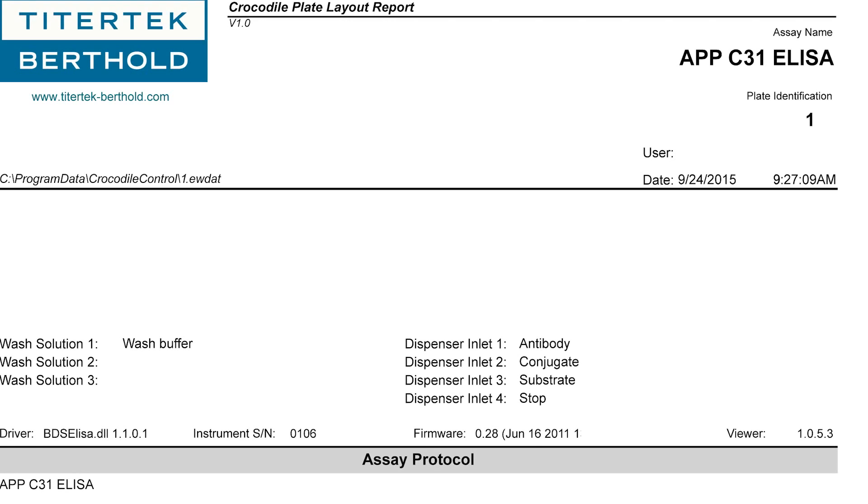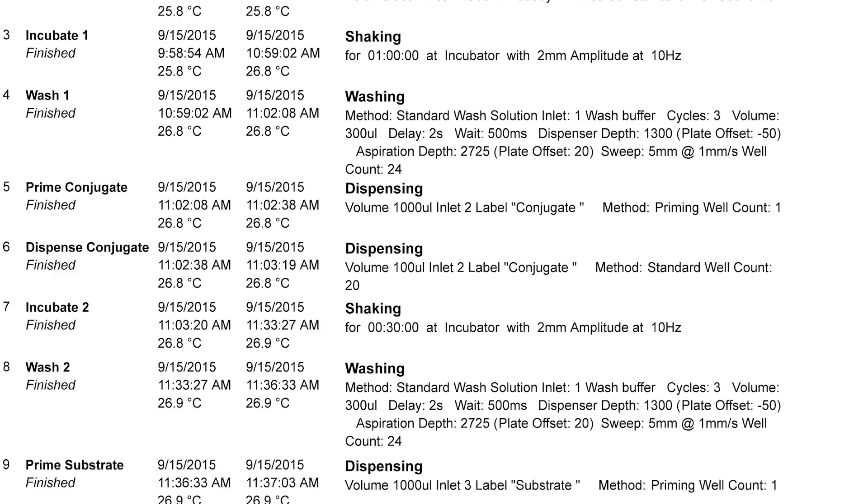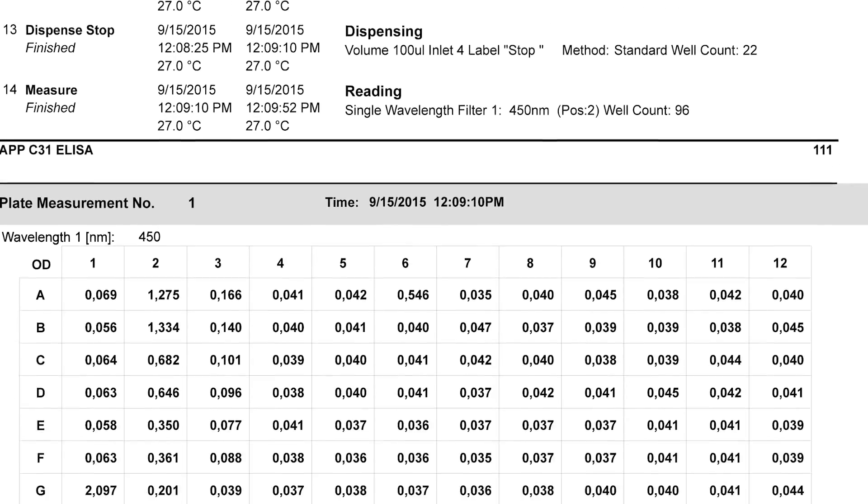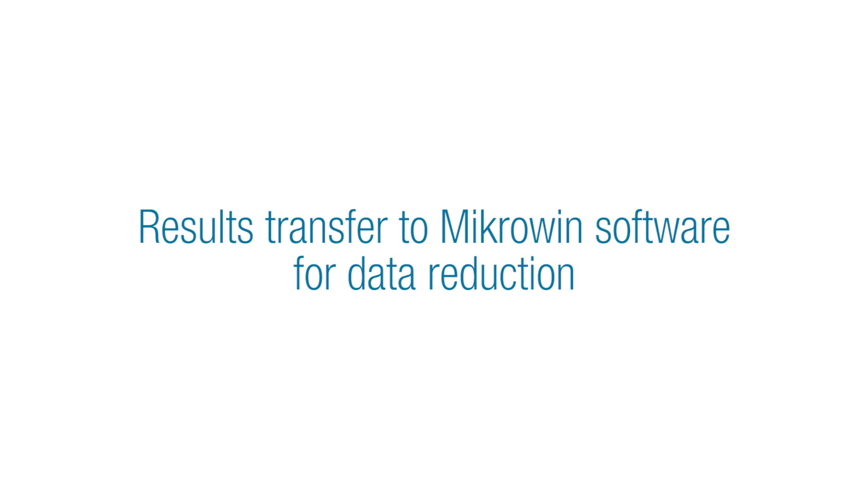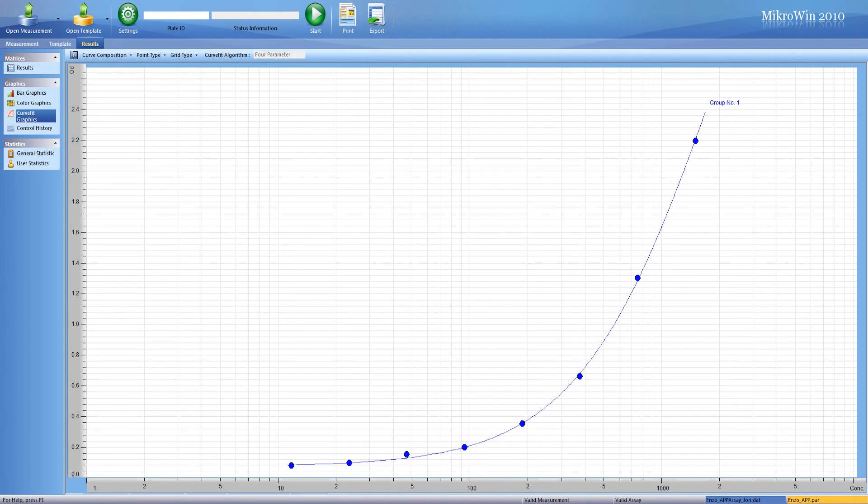Our assay results are exported into a convenient format using our Results Viewer software. Blank wells are subtracted and unknown samples are calculated by using a standard curve with 4PL setting and microwind data reduction software.